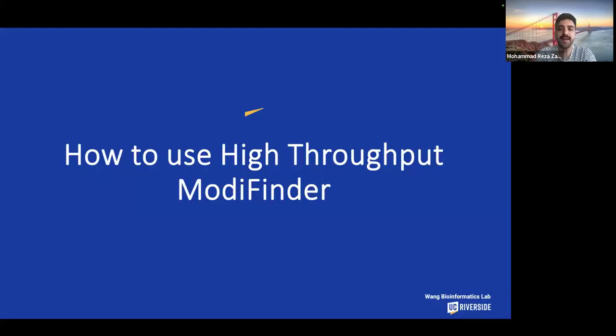Okay, so with that done, now I'm going to go through how to use the high throughput ModiFinder. And this is a workflow in GNPS. So if you're interested, you can follow along these steps with me, and hopefully we end up getting the same results.